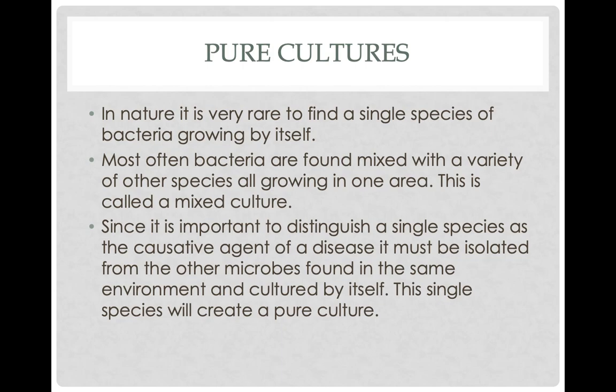So you're going to take a sample from your patient, and you're going to get samples of bacteria that live all over their skin, all over the inside of their nose, different species, species from the environment, and then you'll also get the sample of bacteria that's causing them problems. Now, your job as a microbiologist is to get away the bacteria that's causing them problems from the ones that aren't, because you want to figure out which one's causing problems and which one isn't, because they all look the same. It's kind of hard to do that. So your job is to figure out how to get something called a pure culture. Now, we talked about that earlier with the concept of isolation.